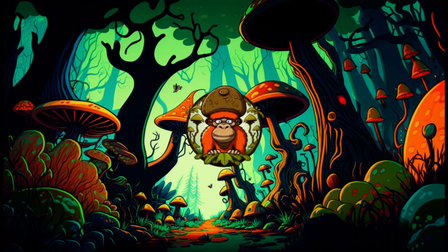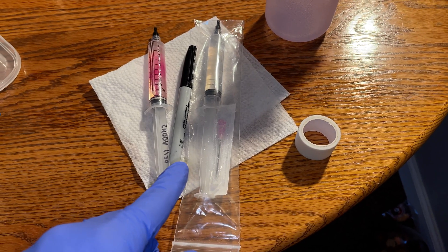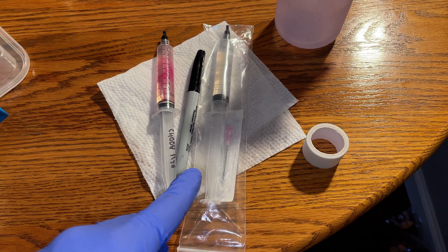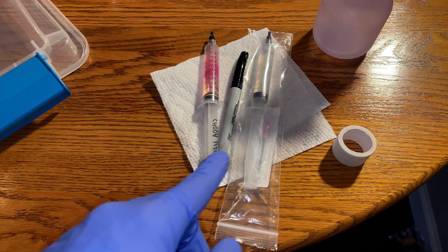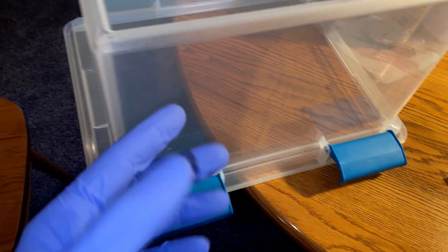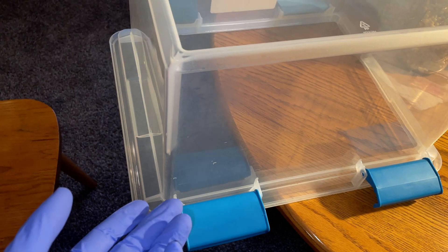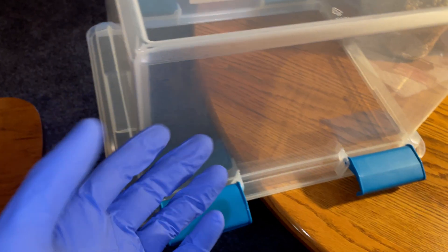Here's to an amazing rest of the year for us all. Anyways, today we'll be going over how to inoculate grain with a liquid culture syringe. This is a colonized syringe that is filled with liquid culture solution. This solution is inoculated with either an agar plate, a clone, or another liquid culture. It's a nutrient-rich sterile solution that when inoculated, the mycelium grows suspended in the liquid.